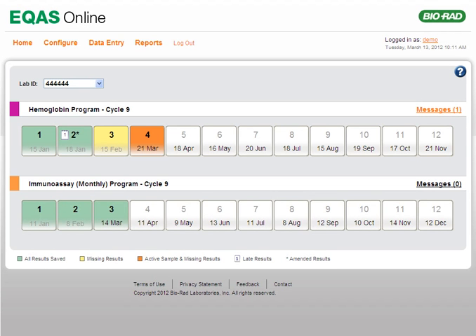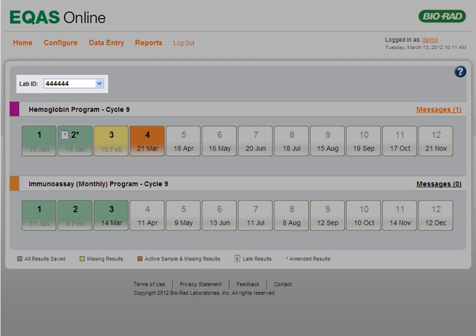Bio-Rad offers various eQAS programs to participant labs. When your lab first enrolls for one or more eQAS programs, Bio-Rad sets up an account and assigns a unique lab ID. This ID uniquely identifies your lab and your eQAS results.